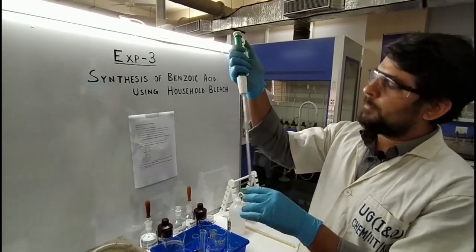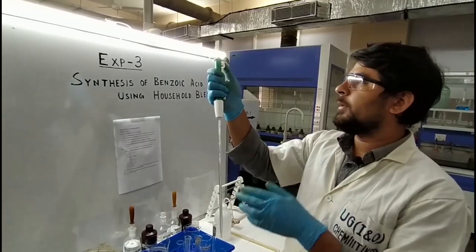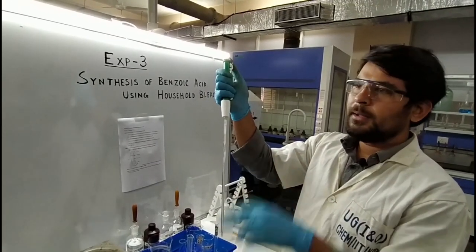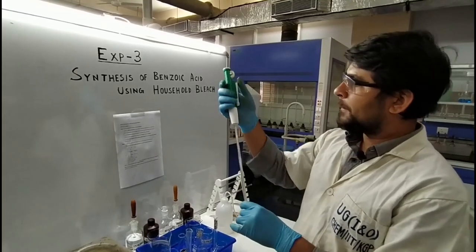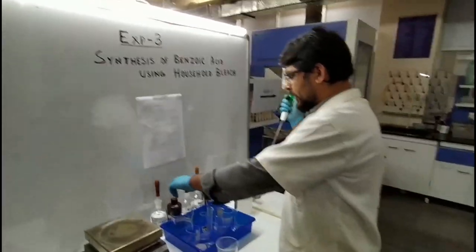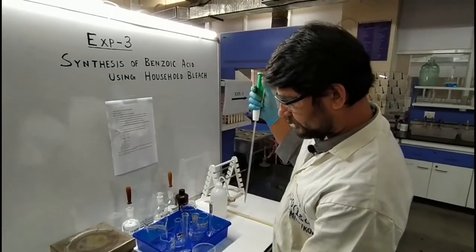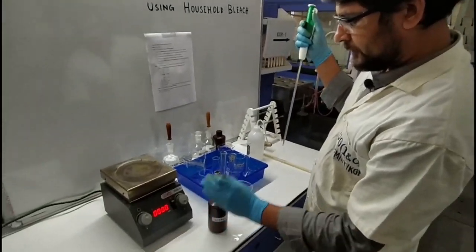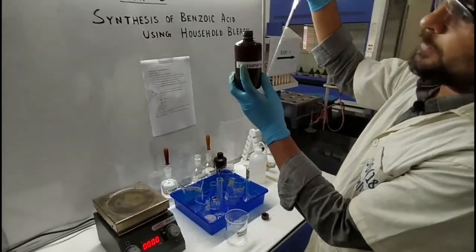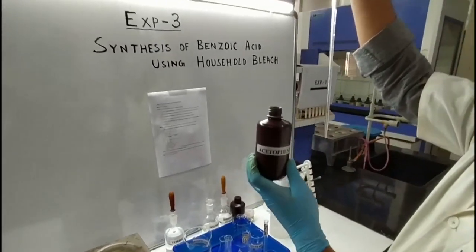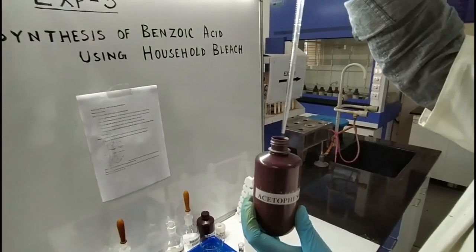If we scroll the pump up, the solution will automatically go up. If we scroll it down, the solution will fall into the respective container. So I am going to take the acetophenone — how much? 0.72 ml. This is the 1 ml mark.